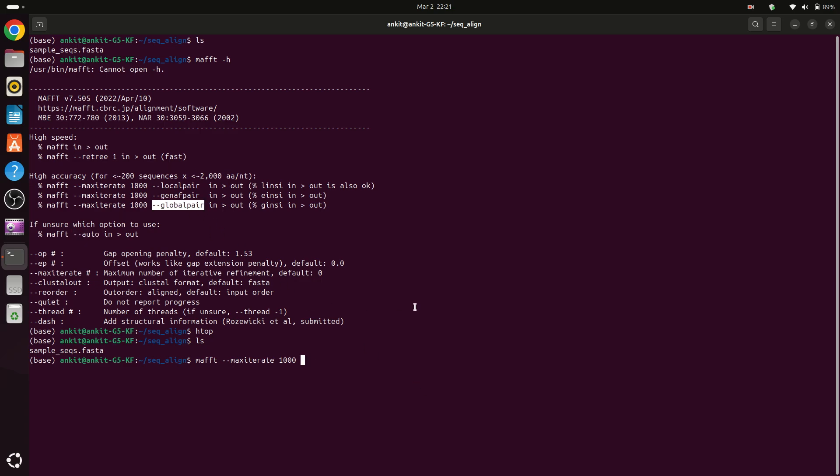Now we have to provide the sample or the sequences that we have in our system. And to store output we will simply type the greater than sign and then we have to give some name for output file.